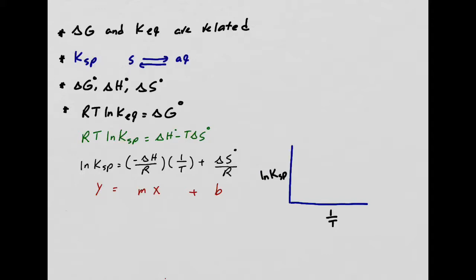Because again, this is my x-axis, this is my y-axis. So I'm going to graph these together. You're going to have data points, and this is going to be a linear relationship.